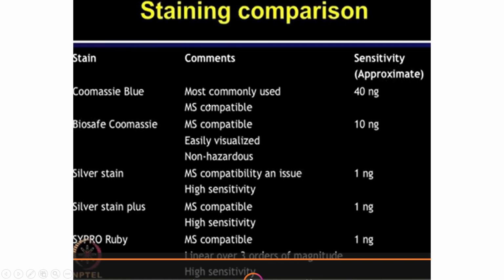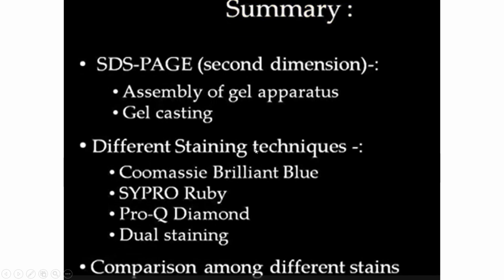you can use these commonly used stains as well. And these stains are MS compatible as well. So if your further approach is doing mass spec, then you can use this staining technique and give it for mass spec analysis also. So that's an overview of staining.